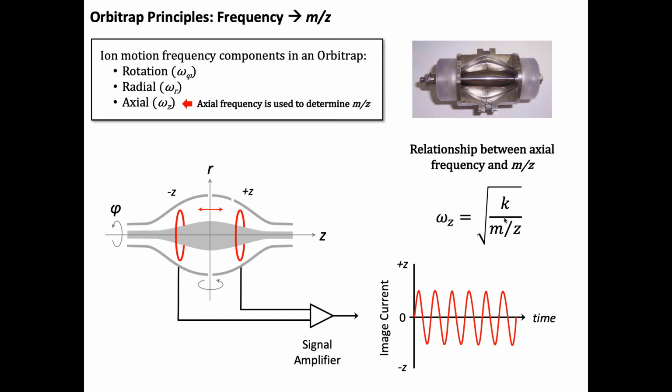So it's not impossible. It's just that in shotgun proteomics, or the kinds of things that we do with glycans or glycopeptides, you're really living in that 2,500 mass to charge down to, say, 300 or 400 mass to charge. And you really don't deviate too much from that window, unless you need to. And if you have to, you know that the higher you go, the less your analytical figures of merit are going to become. Okay?